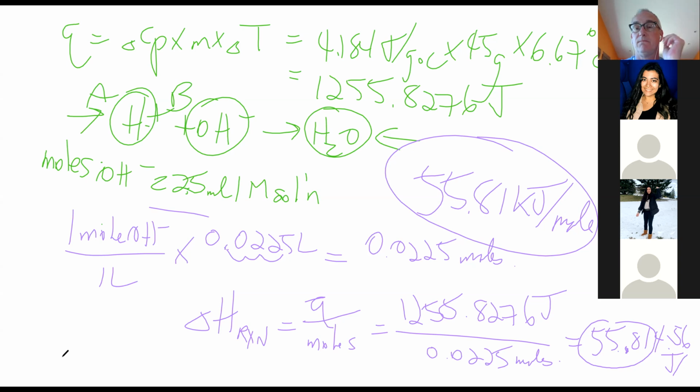Professor, I want to ask you, for each reaction, should the end result be similar? You mentioned that reaction 1, I have to do it twice, but with different amounts. And the final result should be similar? Your Q should be different, and your delta H reaction should be the same. If not exactly the same, pretty close.